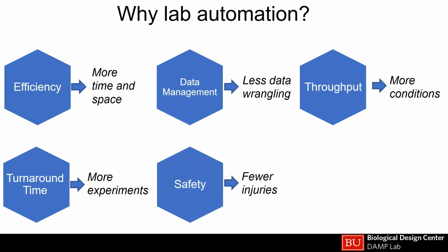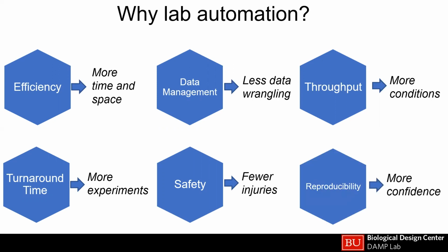Safety is important. Something that frequently is talked about is the overuse injuries from pipetting 1,000 times repeatedly. And then reproducibility, so you can have more confidence that a process will do it the same the first time and the 100th time or the 1,000th time, which can get you in trouble too. If you've written a bad liquid handling script, it'll be bad on the 100th time too. So, always room for improvement with those, but not to point fingers at anybody.